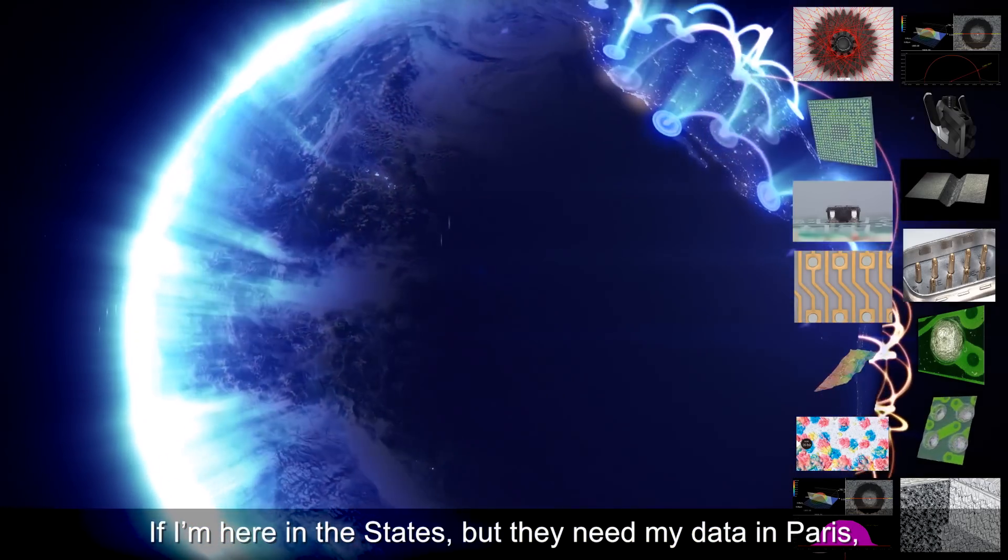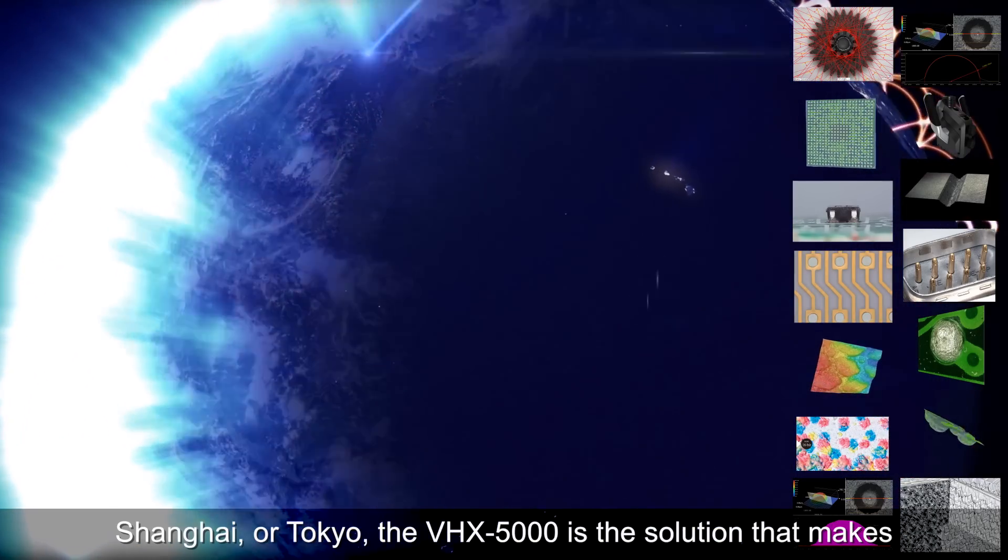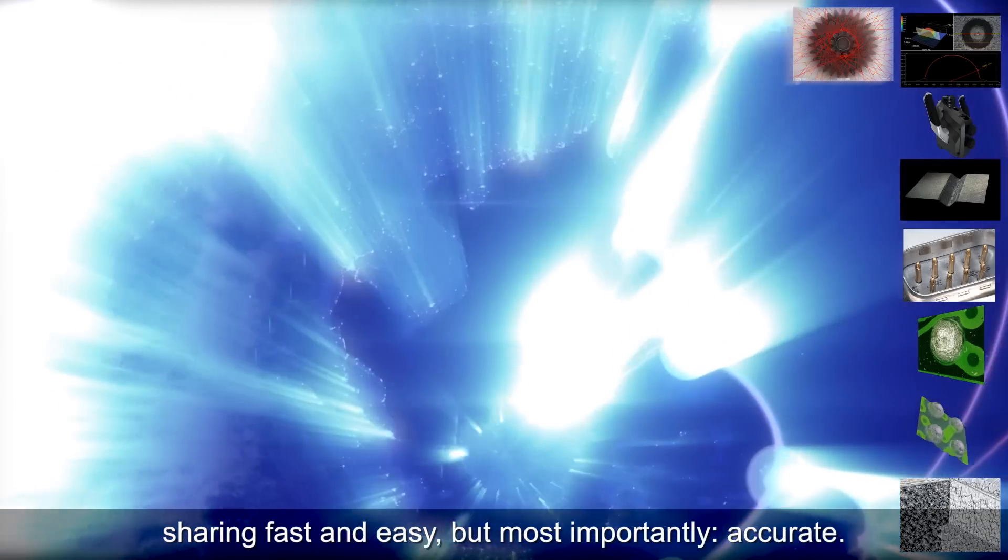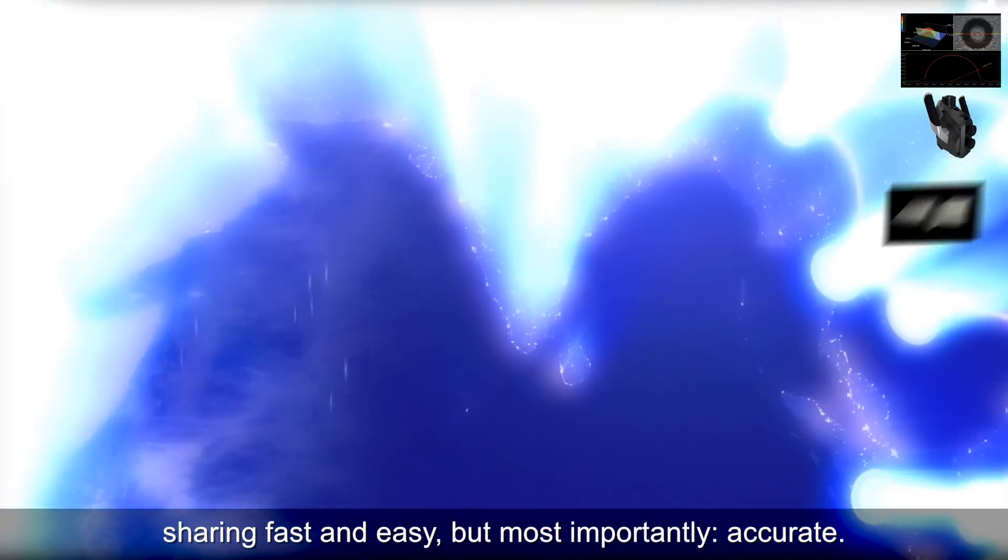If I'm here in the States, but they need my data in Paris, Shanghai, or Tokyo, the VHX5000 is the solution that makes sharing easy and fast, but most importantly, accurate.